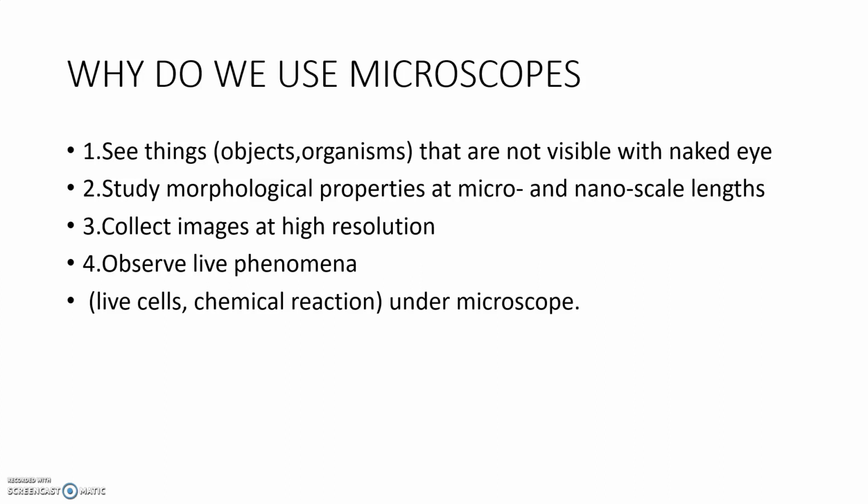So why do we use microscopes? Microscopes are used to see objects or organisms which are not visible with our naked eye.